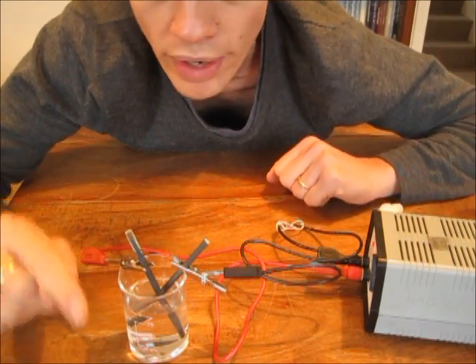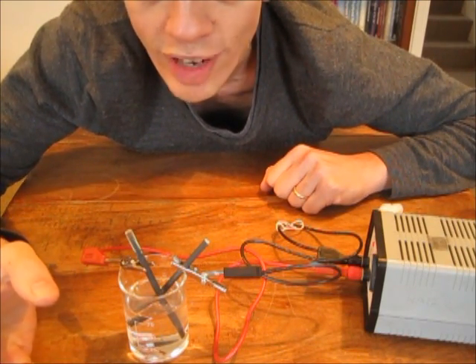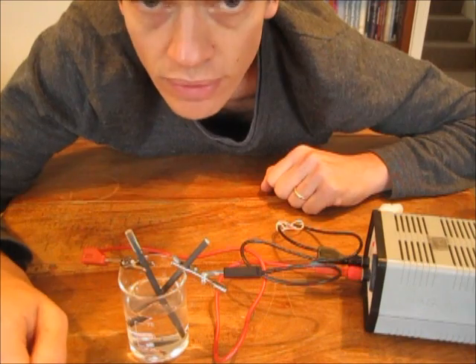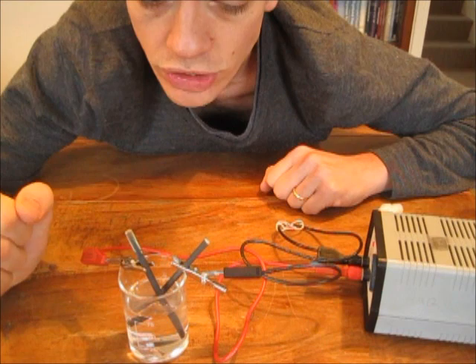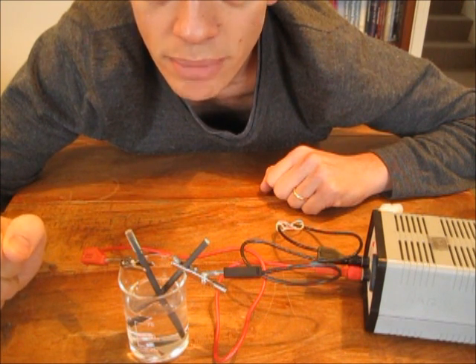I know that at one electrode what is being given off is chlorine gas. I can smell that. At the other electrode what is being given off is hydrogen. We are now going to look at that in more detail.